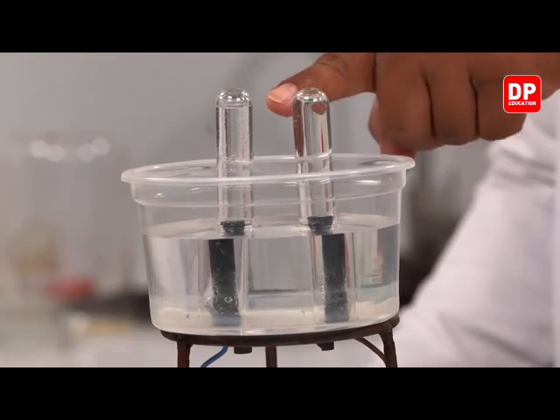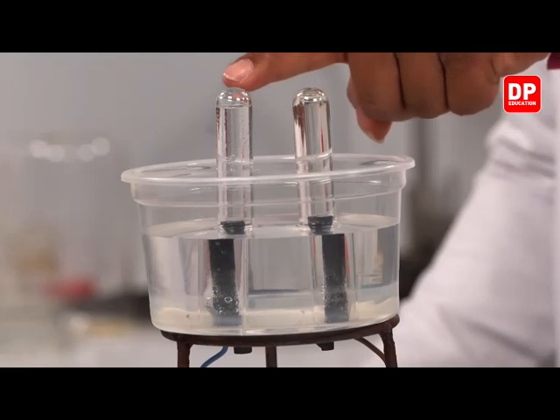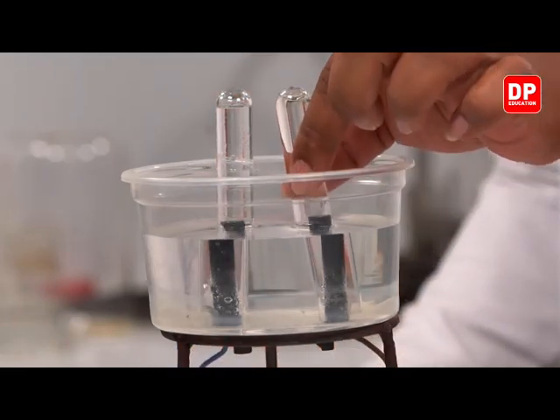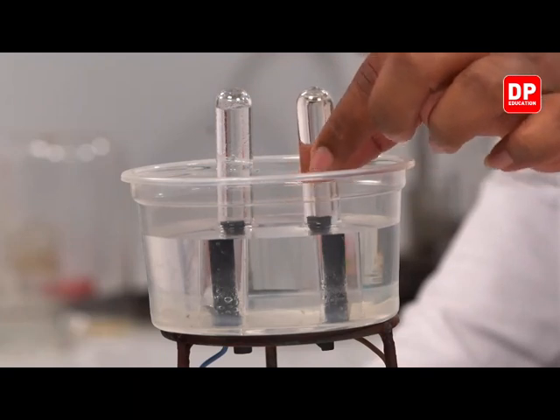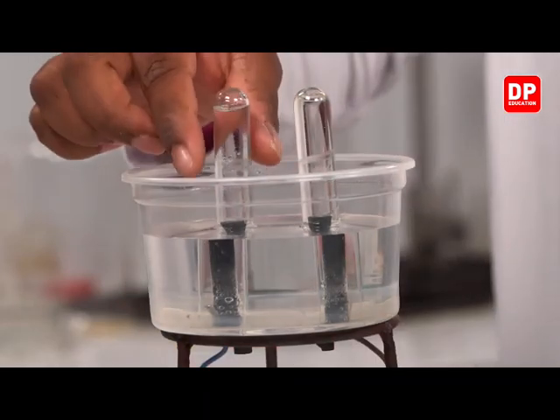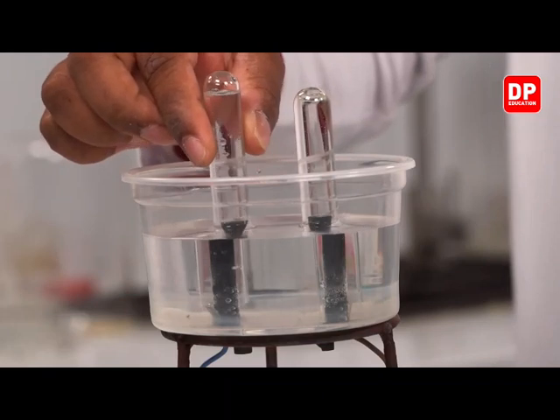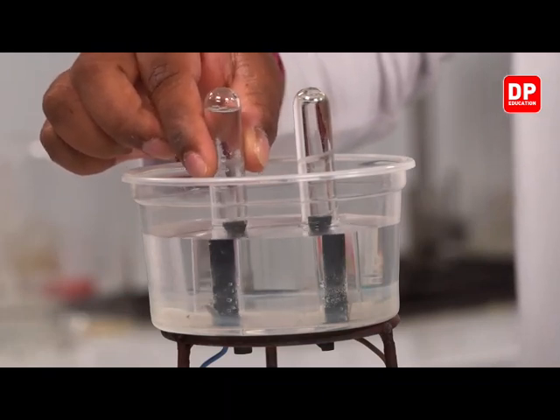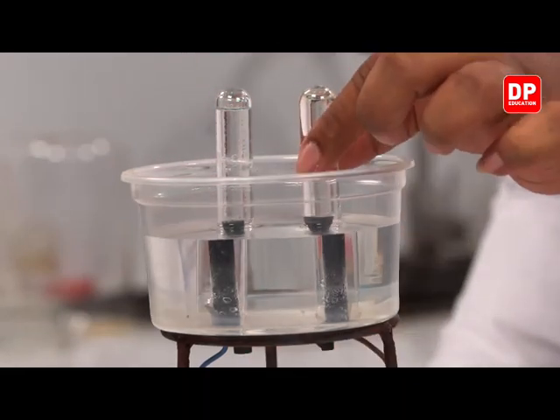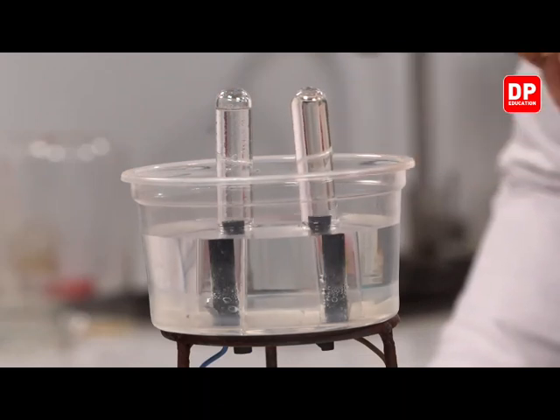As you can see here now, it's very obvious and very clear to us that more gas volume is being collected onto the negative terminal. The gas volume which is collected at the positive terminal is somewhat lesser than it. More gas volume has been collected onto the negative terminal, as you can see, it's very clear to us. However, the gas volume created at the positive terminal is somewhat less.